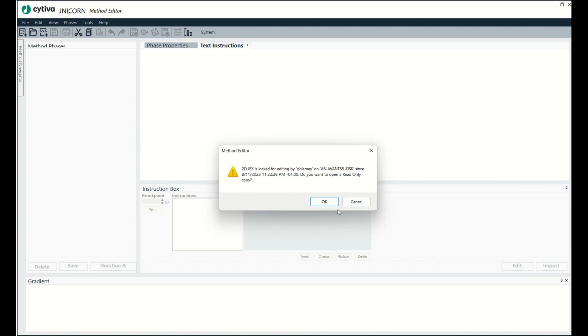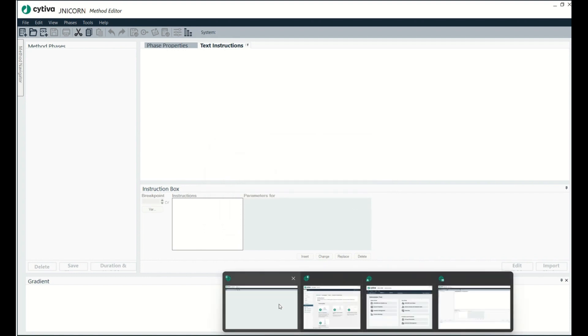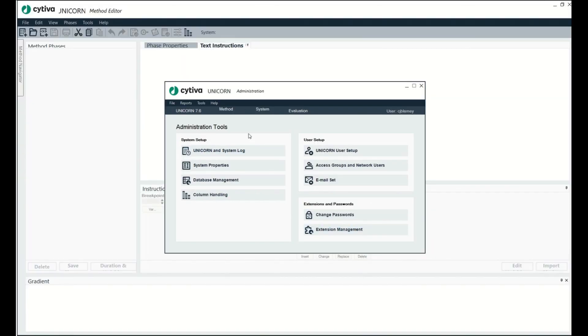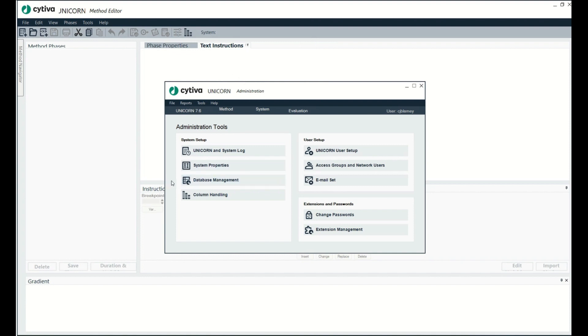So I'm going to go down here and go to the administration module, which I don't think we've used yet. Maybe I showed it briefly in one of my first videos. What I'm going to do is go to this button right here, database management, and click on it.